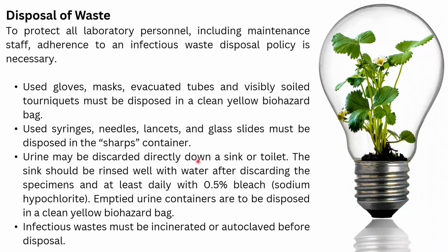Urine may be discarded directly down a sink or toilet. The sink must be well rinsed with water after discarding the specimens, and at least you have to clean it daily with 0.5% bleach or sodium hypochlorite. It says here, class, it's 0.5% bleach, but almost all the other references that I have read made use of 10% bleach. So during the examinations, don't worry if we have 0.5% or 10%, either of the two is correct.